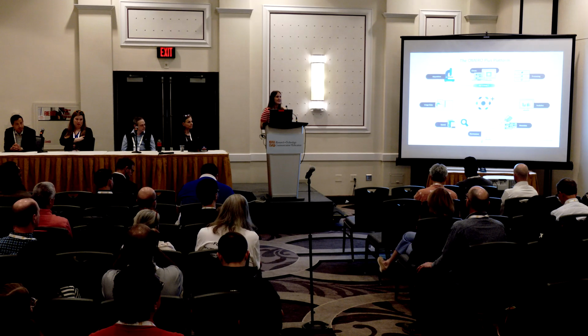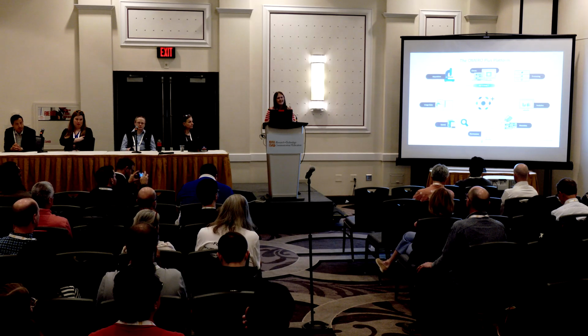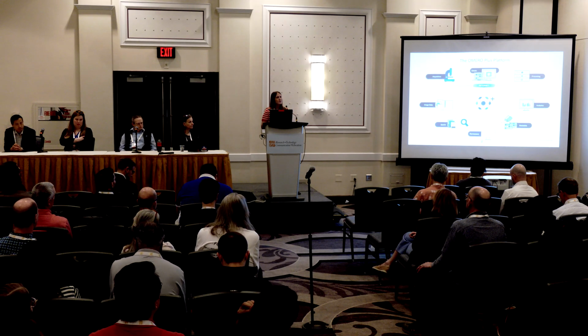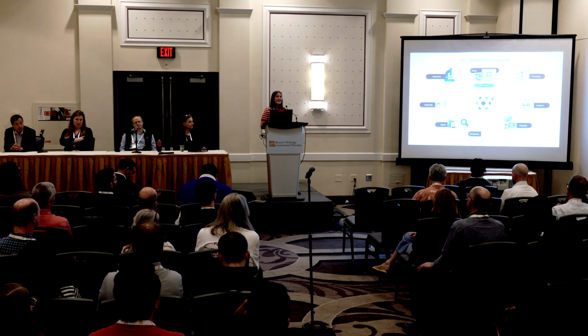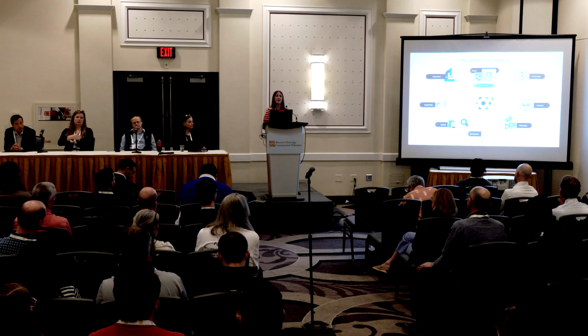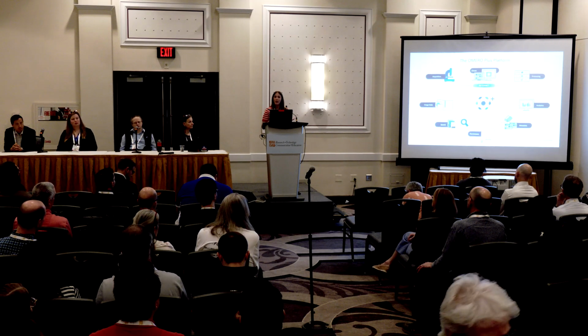I think increasingly, image data management is still very much about tagging images with appropriate metadata and making it more findable over time. But the complexity and size of image data today means that just interacting with your images, viewing them, annotating them, sharing them with a colleague is a large task.